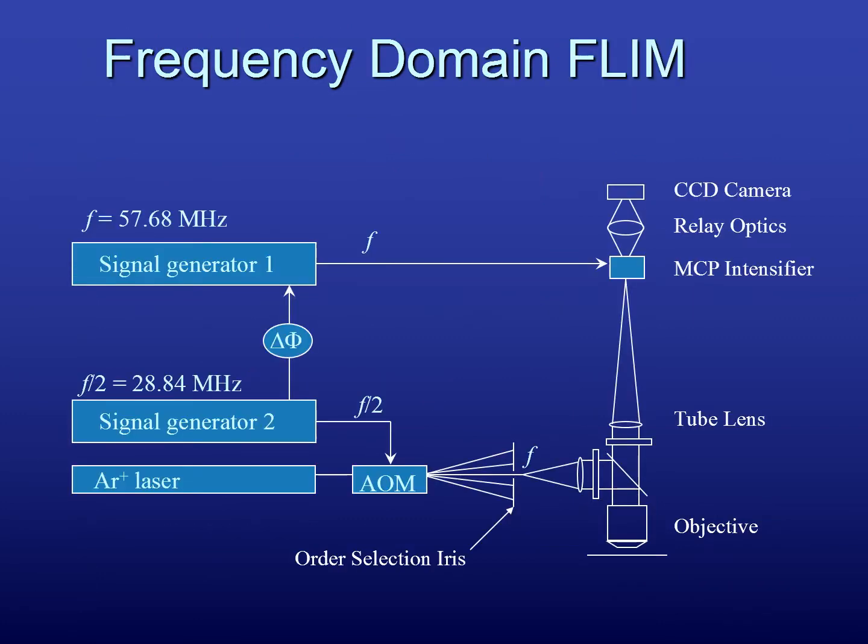So we've now seen the box car. TCSPC stands for time correlated single photon counting. So that was the second method of measuring the lifetime. And now I'm introducing the third method called the frequency domain fluorescence lifetime imaging microscopy. So how does that work?